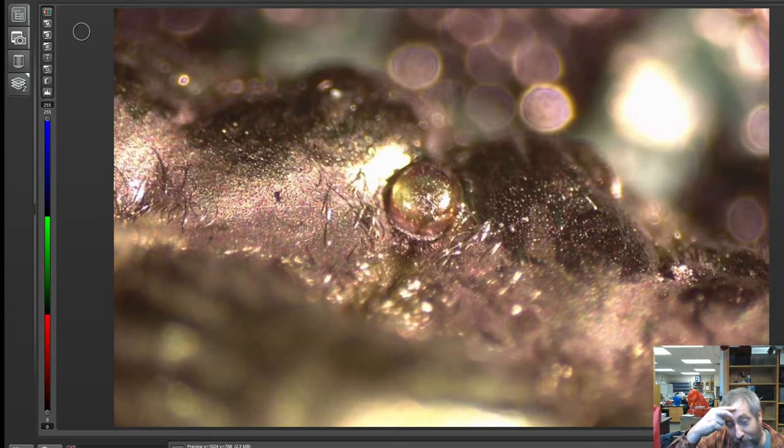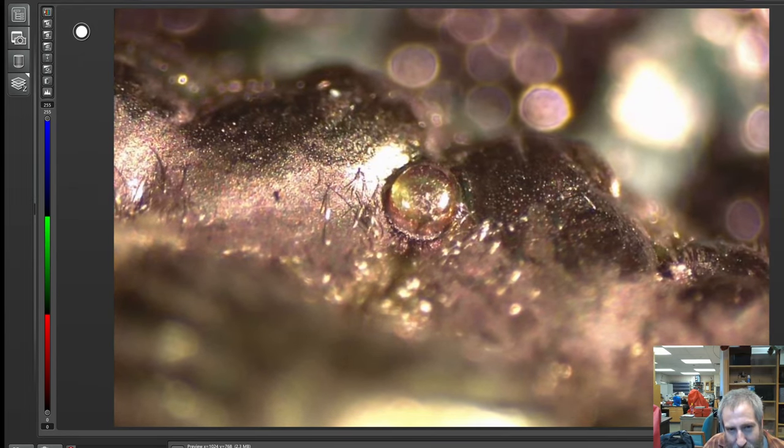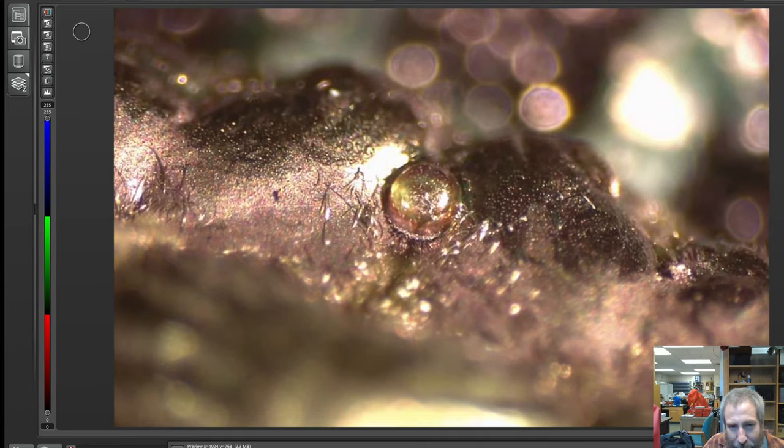Not all insects are this way, but a lot of the flying insects, like flies and bees and locusts and grasshoppers and whatever, they have three little eyes in the center of their heads that are used for light and for orientation. So they can tell which way the sun is, and then they can fly towards or away from things based on the light. So it gives them a sense of direction, and they use that for navigation mostly.